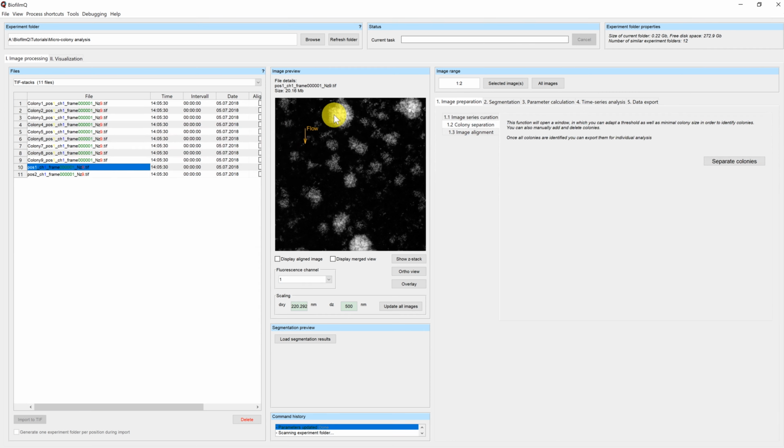But today we'll now come back to this first way of looking at the image, where we said that we could also treat each colony as an object in the field of view, and then just calculate a number of statistical properties for these objects, for example, their size distribution, like standard deviation or mean and max value. This is, for example, useful if you do a screening and you want to find optimal conditions for your biofilm growth, then you would do that.